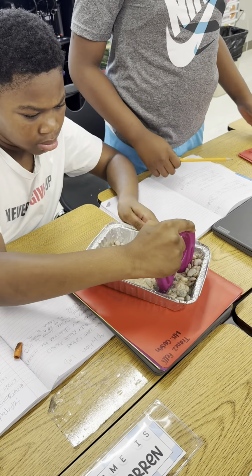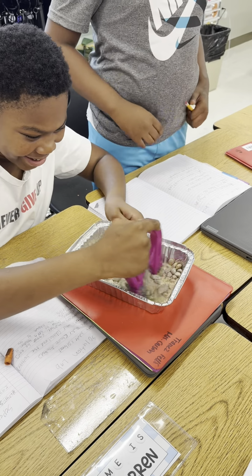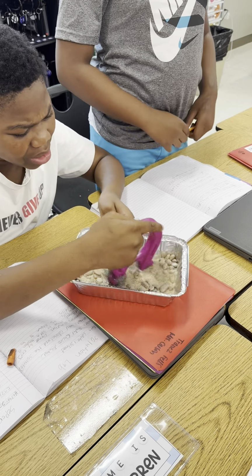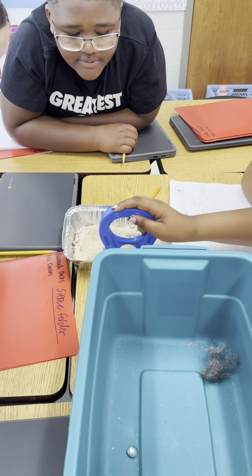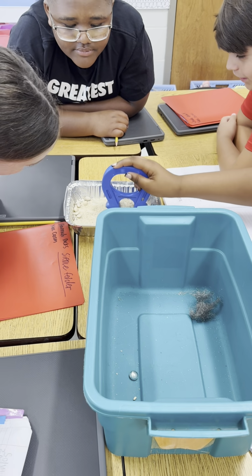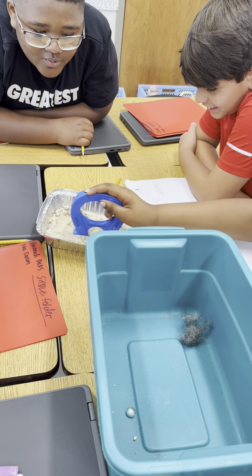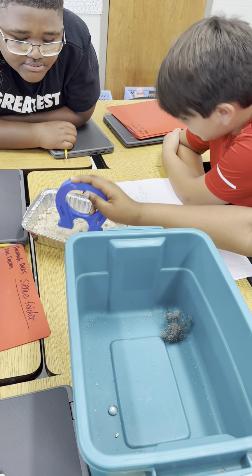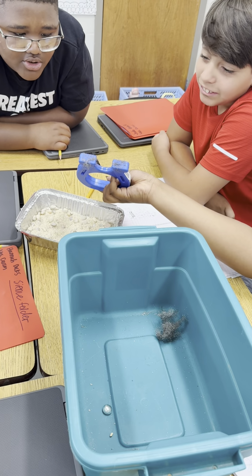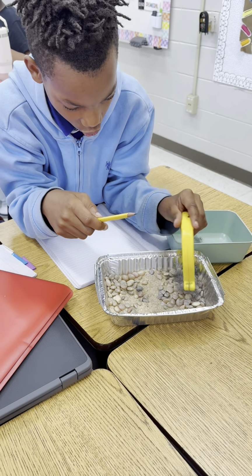You're not doing it right. You're not doing it right. I don't know what you're doing. She said mix it. I'm really mixing it up now. Mixture. Oh, that's pretty. I want to see it.